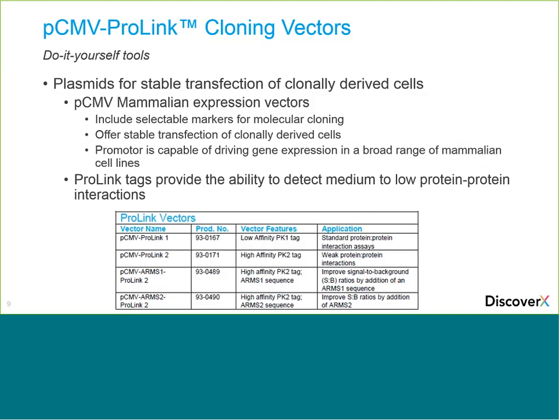All right, so looking at the picture, you see some dark blue lines. This corresponds to what I spoke about in the last couple of slides, where you're starting with your cell line, you do transduction, you get your cell pool expressing beta-arrestin 2EA, follow that up with transfection going down to the next line. You get a cell pool, after transfection, with the GPCR PK and your beta-arrestin 2EA expressing, and then you confirm it using the assay at the bottom. But what's highly recommended is to generate the other two stable cell lines as well.